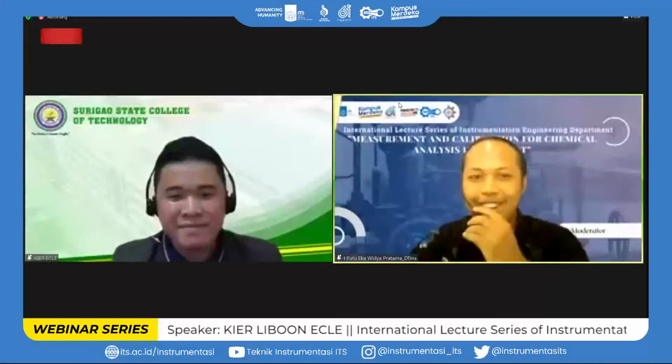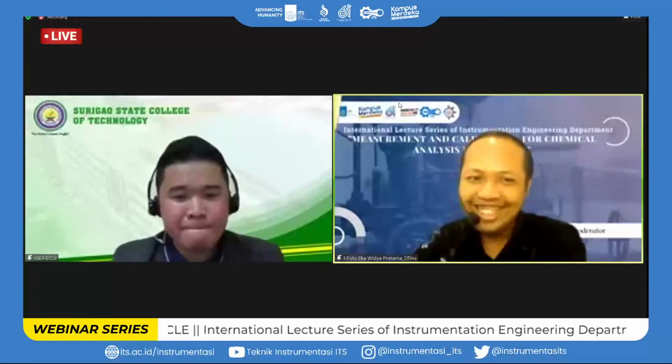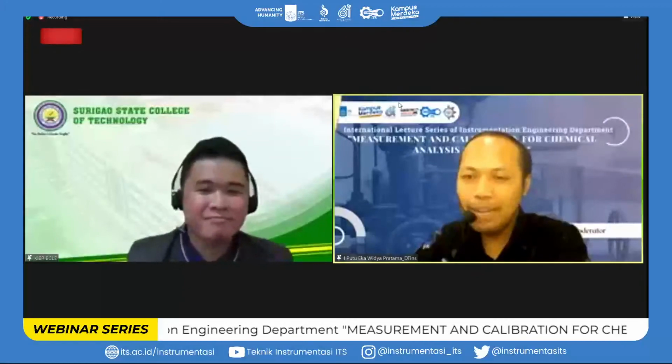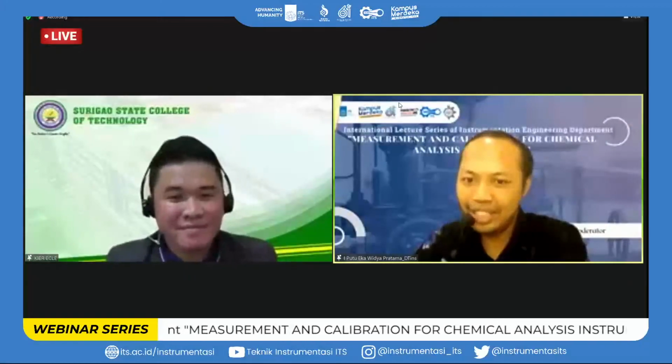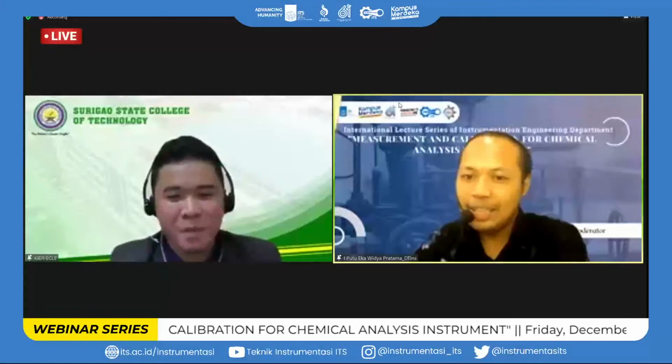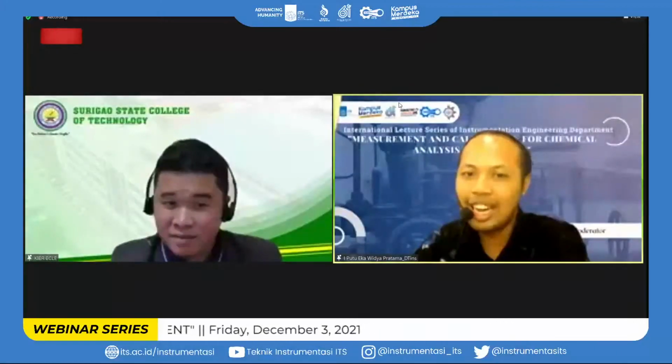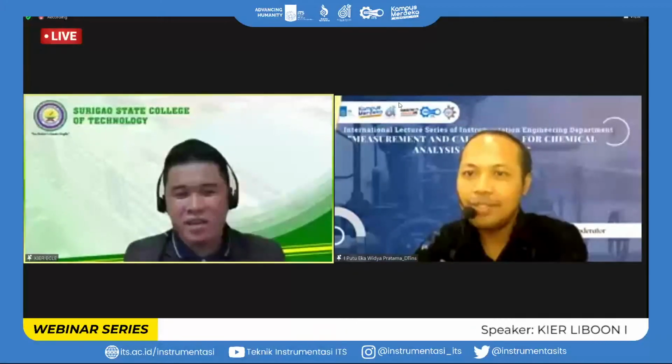Okay, thank you. Followed by the second question, sir. Considering there are a few types of chemical instrument calibration, what is the method of calibration that is most likely used in calibrating the UV-visible instrument? Okay.